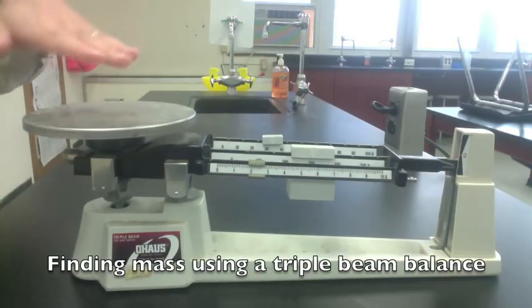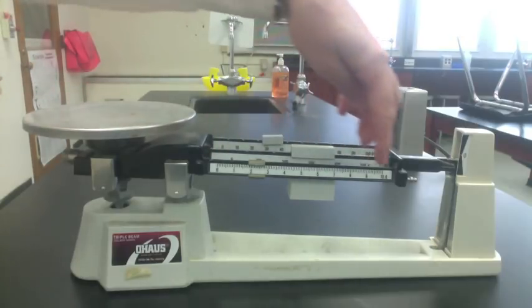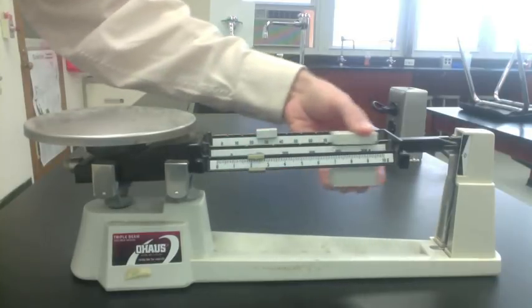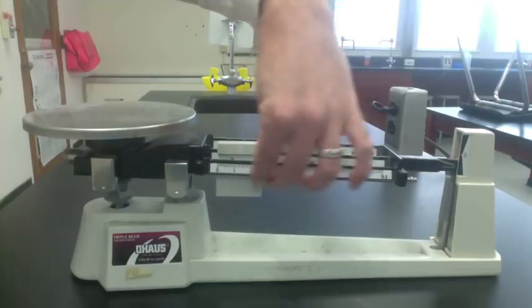Let's look at the parts of the balance. You have the pan — that's where the object goes. Put the object in the center of the pan. You have beams; there are three beams. Each beam has a rider. The first one's in 100 grams, the second one's in 10 grams, the third one's in 1 gram.